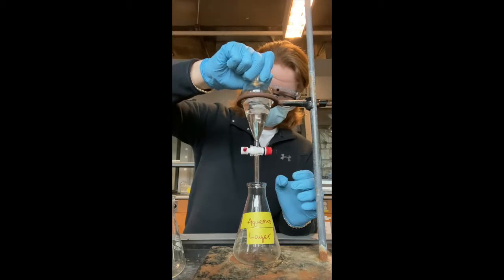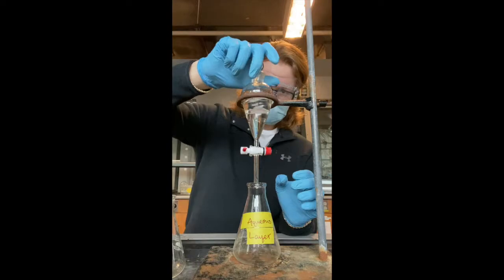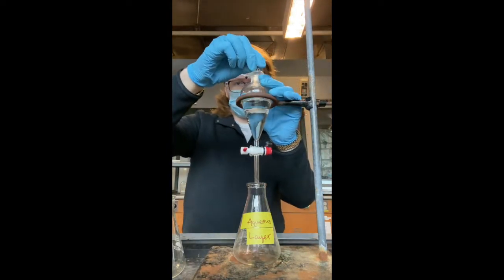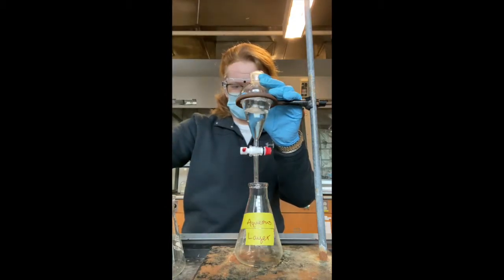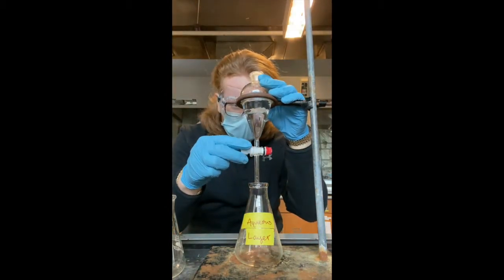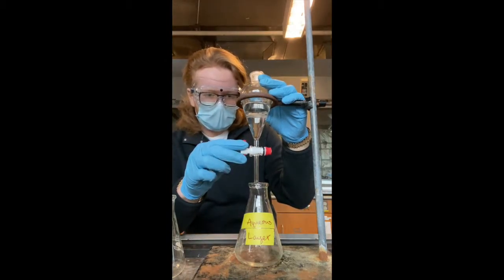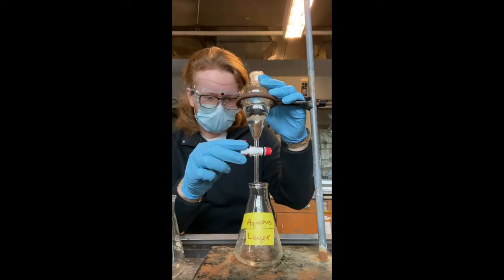Now there will be an organic layer on top, which consists of the solvent hexane with the compound benzophenone, and the aqueous layer will be on the bottom, which consists of distilled water. First, you need to pull out the glass stopper to allow you to pour out the liquids. To ensure that nothing is contaminated by being poured out of the same place, you will be draining out the aqueous layer through the bottom and pouring out the organic layer from the top.